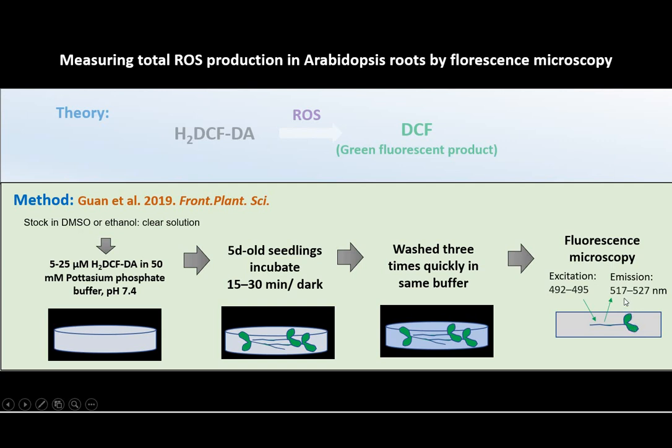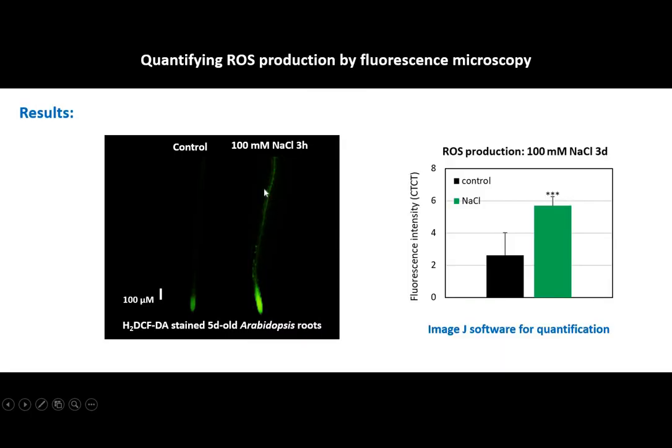Total ROS production can be visualized under fluorescence microscopy at around 525 nanometer emission wavelength. This is the final output — you can see bright green color for the fluorescent product. Using image analysis, you can quantify total ROS production. Good luck.